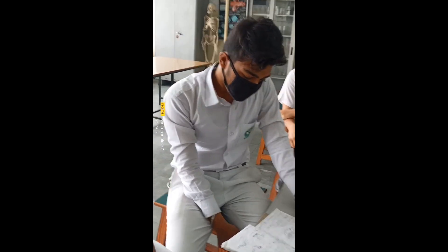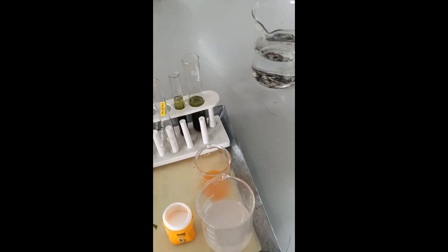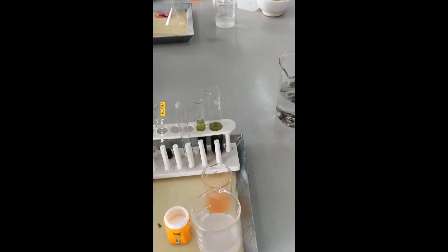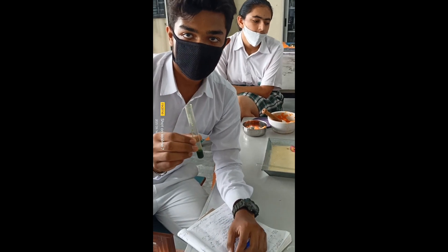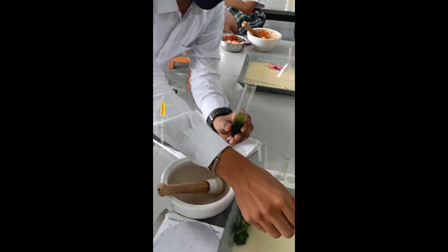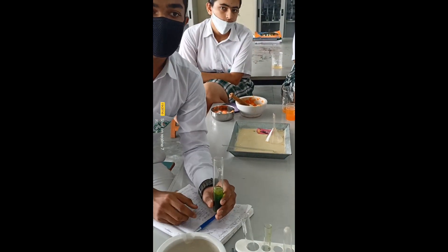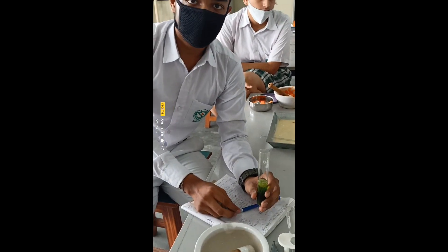For the reactions to take place, the cell membrane needs to break down. We have added distilled water, NaCl, and shampoo solution. The function of shampoo is that it acts as a weak detergent and helps to break down the cell membranes so that the fluid comes out.